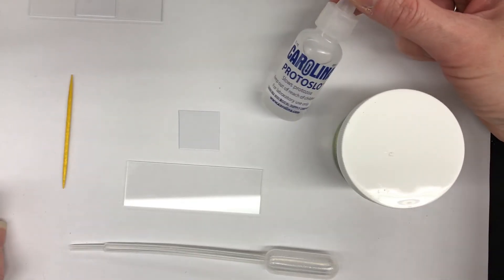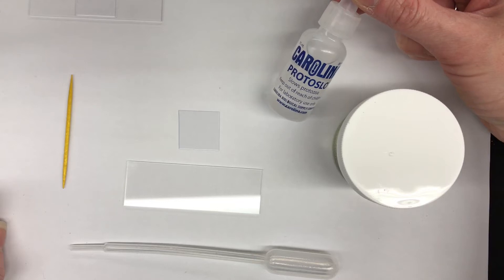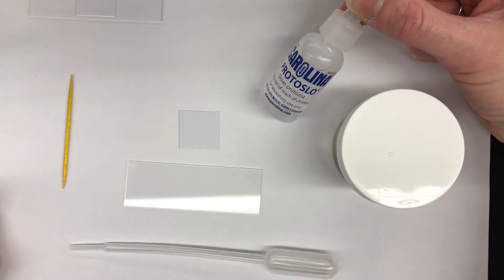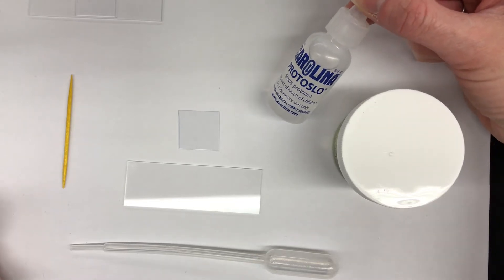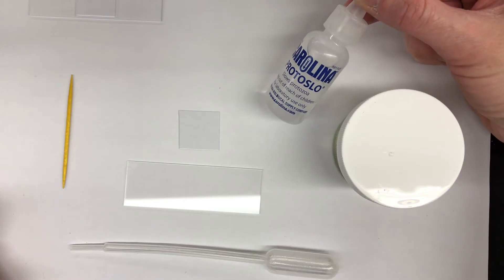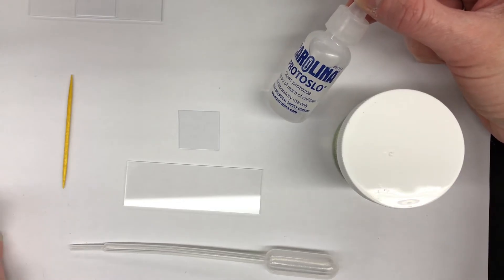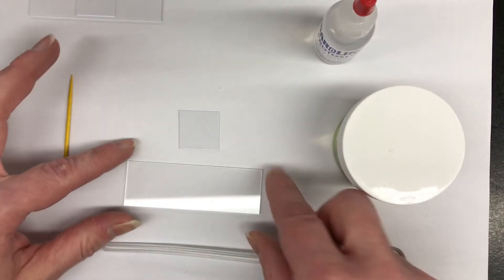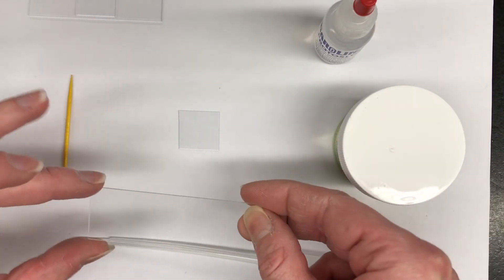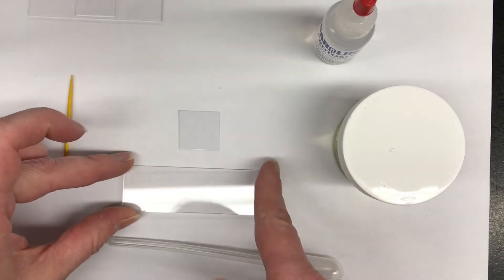What protosloe does is it slows down the movement of the protists because they move very quickly. We will use the protosloe with both the euglena and the paramecium. So the first thing we do is check to make sure that our slide and our cover slip are nice and clean.